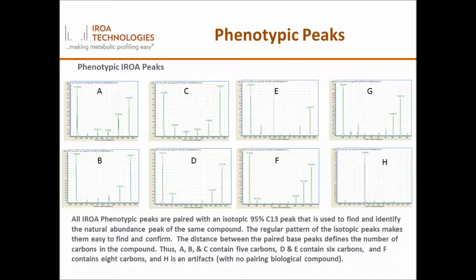If the pooled standard is well characterized and the compounds that are present in it have already been identified, then all of its compounds may be used as a point of comparison. Artifacts will have no match in the standard and are eliminated by Cluster Finder software in the final data set. In the phenotypic experiment, all experimental samples are measured relative to the standard. Therefore, the phenotype is defined by the deviation from the standard.